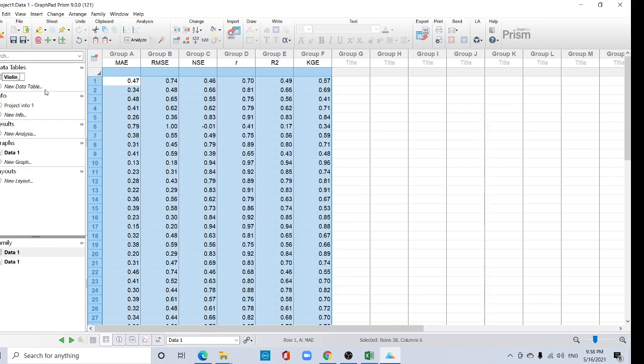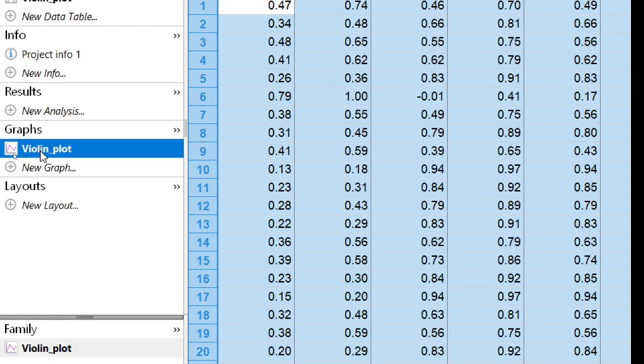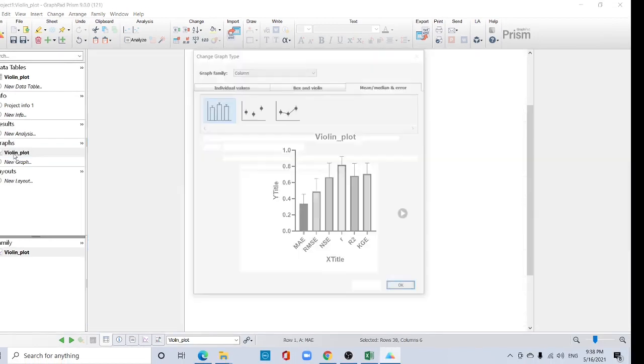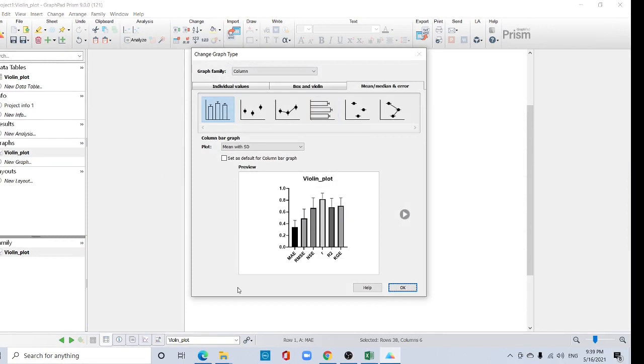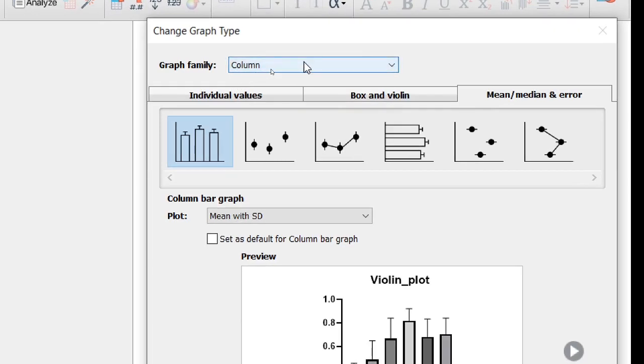Violin plot. Here the graph section, see this graph section, click here. Then this interface will be open.